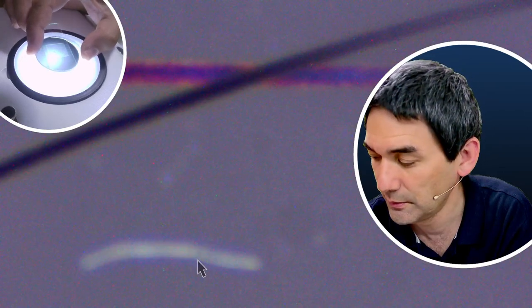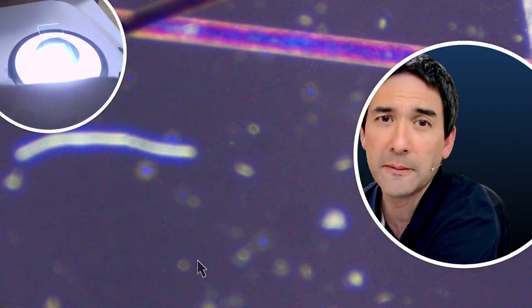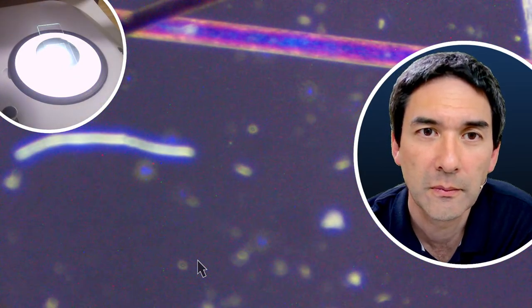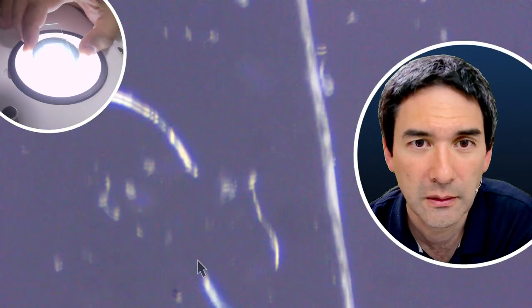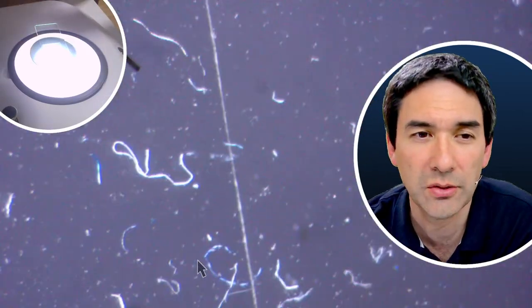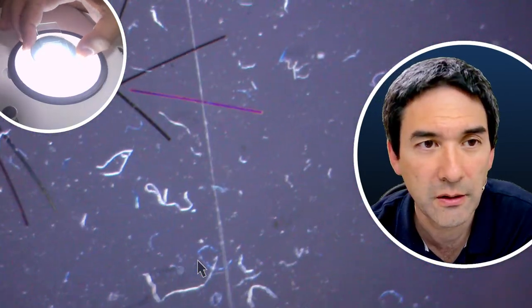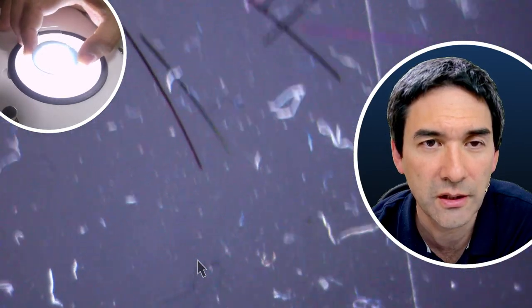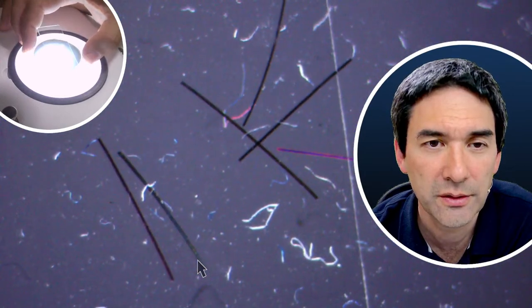Oh. Okay. Let's turn up the light intensity a little bit. All of those white things that you see, that's of course dust. Yeah, lots of dust and dirt. Maybe I'm going to zoom out a little bit too. Here is my hair. Those are the little dark lines that you see. There is quite a bit of latency in the camera. Yeah, so that's my hair.